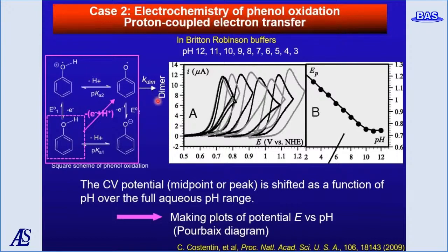By analyzing the CV carefully, the successive chemical reaction rate was determined, and the concerted electron-proton transfer process was found in these systems.